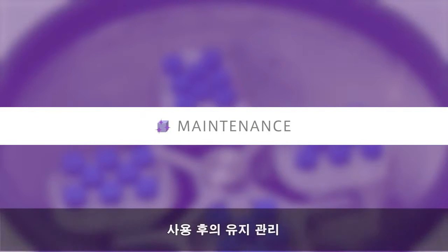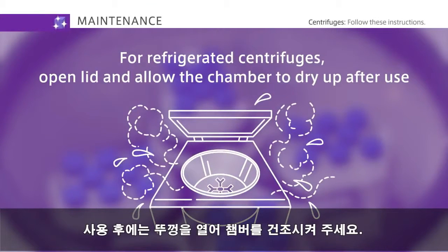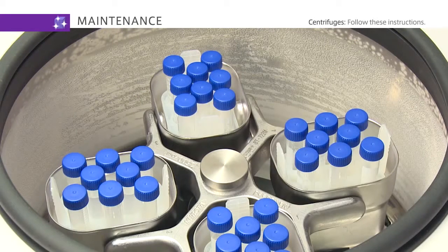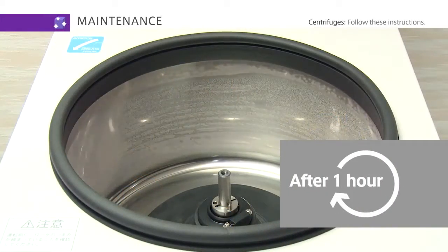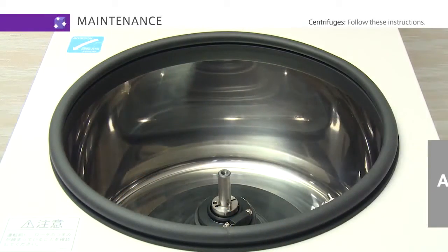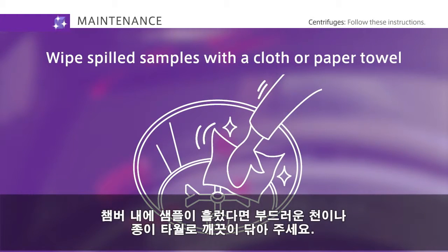Next, follow these instructions for maintenance after use. For refrigerated centrifuges, open the lid and allow the chamber to dry up after use. If a sample spills out inside the chamber, wipe it thoroughly with a cloth or a paper towel.